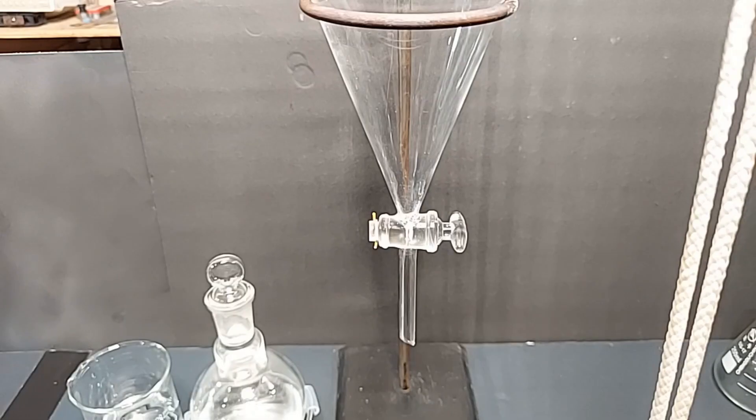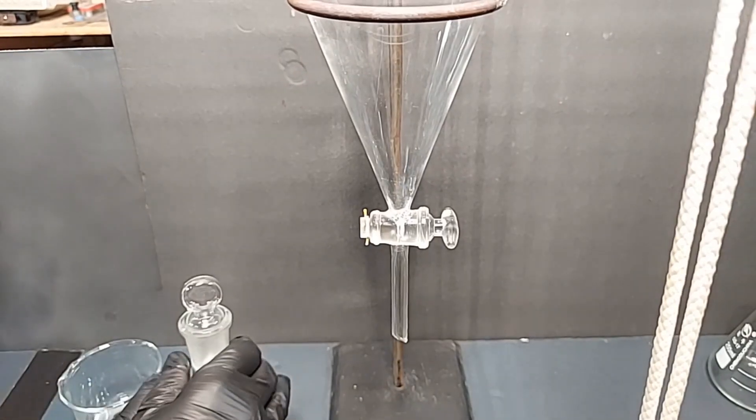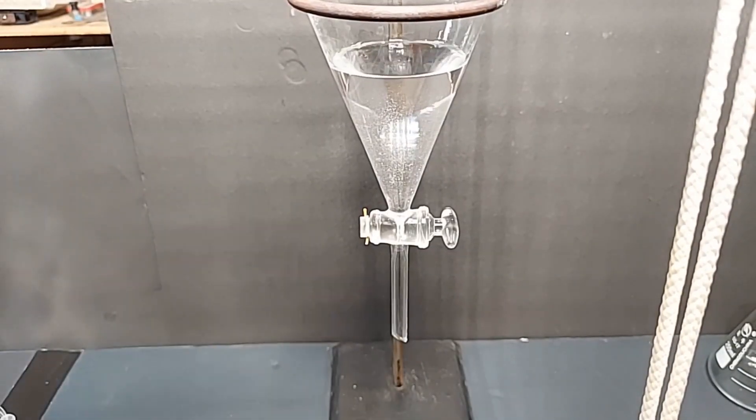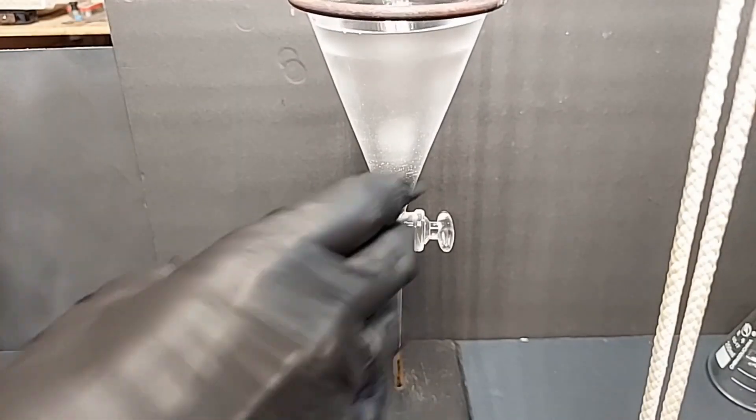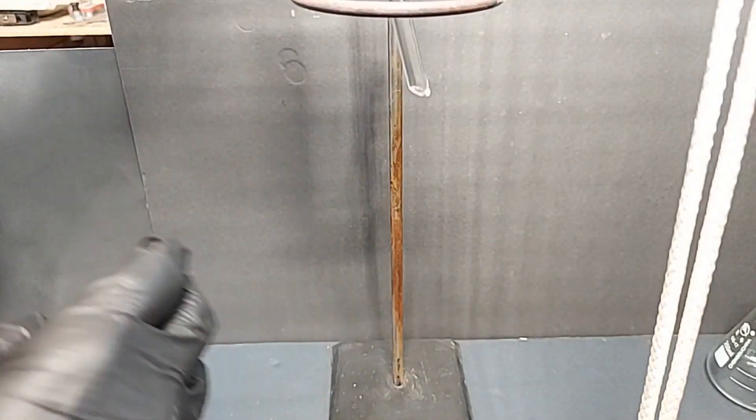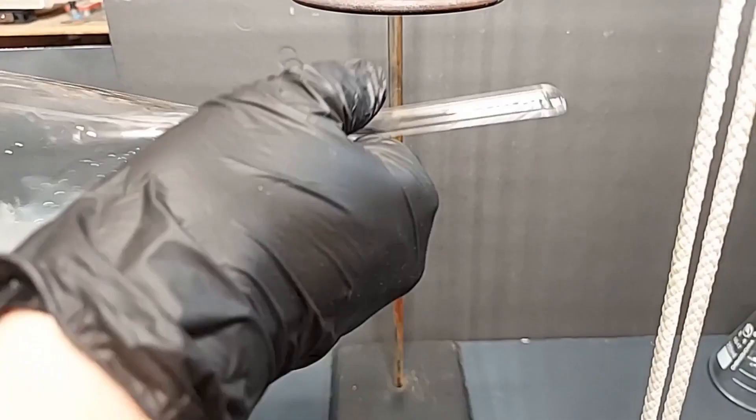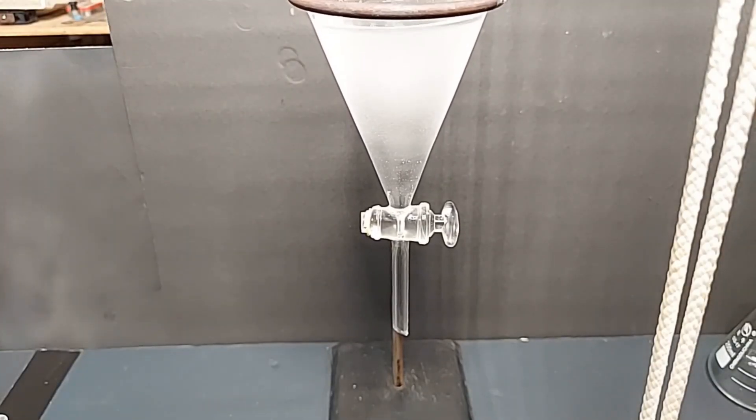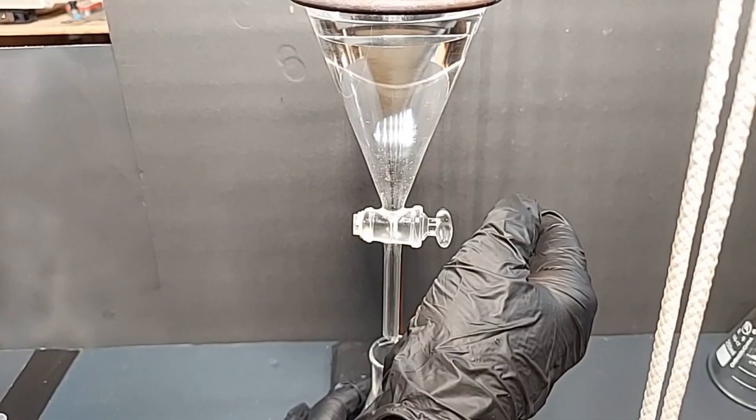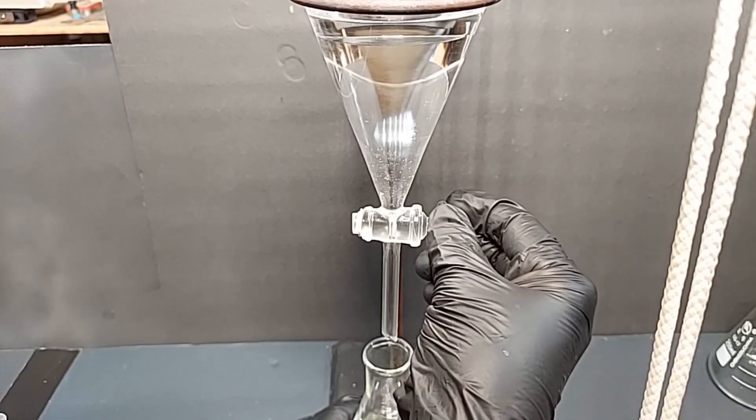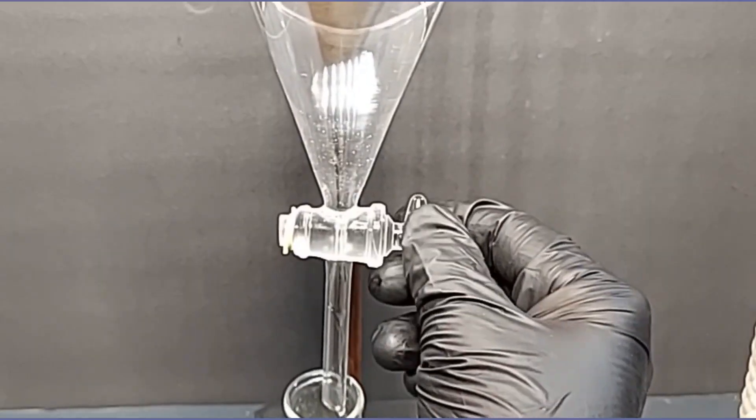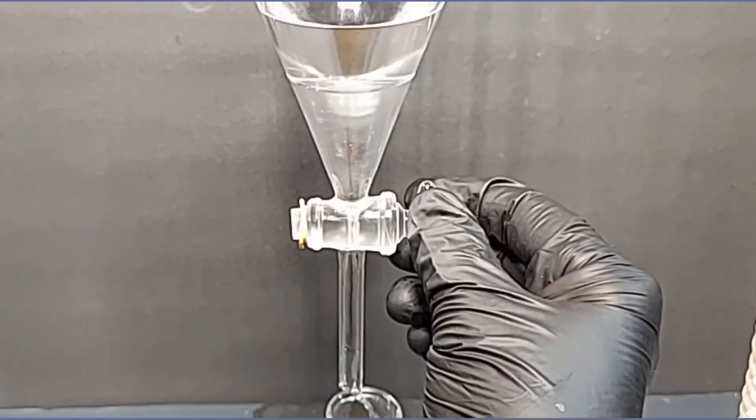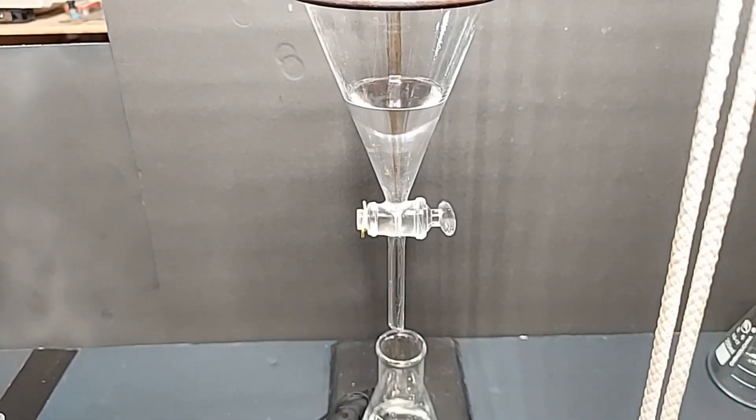I'll first add the ethyl acetate so we can get started. Just adding the ethyl acetate. Now adding the cold water. The aqueous layer is forming on the bottom, and I'll drain that next. Removing the aqueous layer along with some of the sulfuric acid, some of the acetic acid, and some of the ethanol.